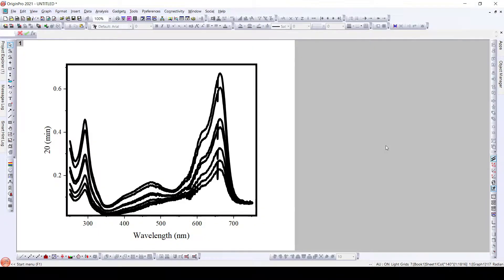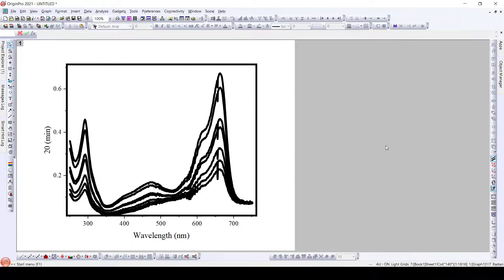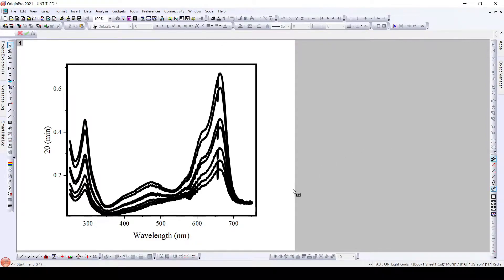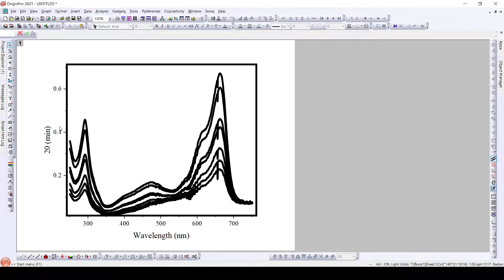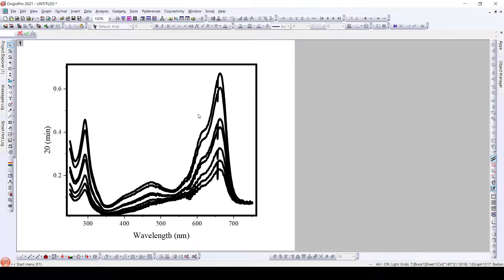Hello friends, today we are going to learn to color different graphs or color graphs that we plot in Origin Lab. As we can see here, these are certain graphs that I have plotted in Origin Lab and they all have same color.